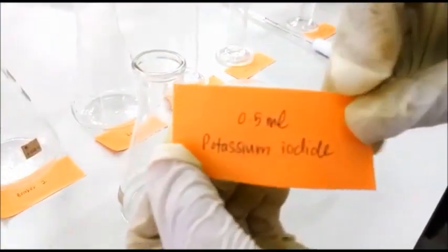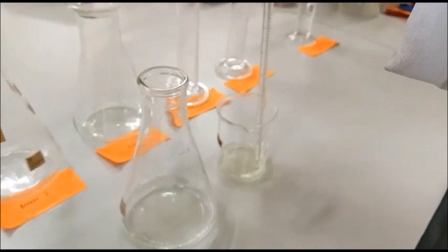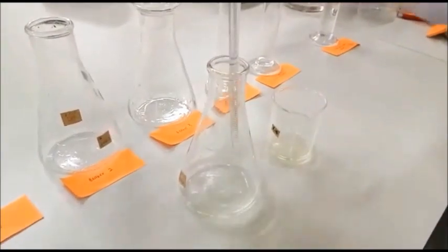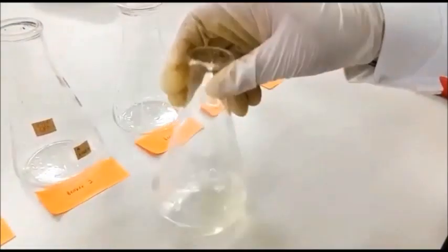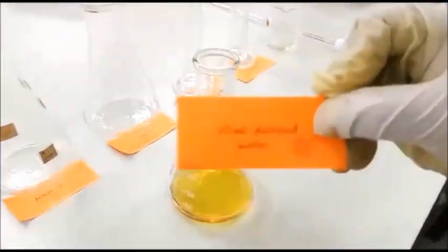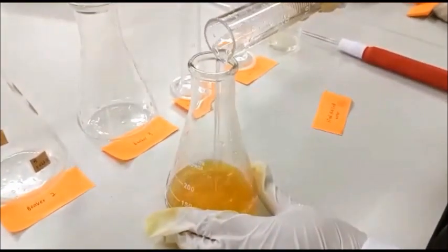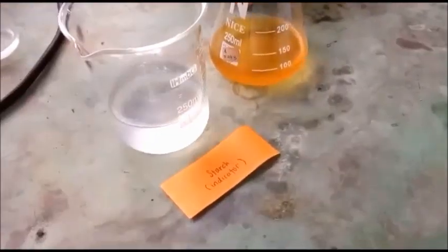Next, add in 0.5 ml of potassium iodide. Notice the color changes. Add in 30 ml of distilled water. The mixture is shaken for 1 minute.